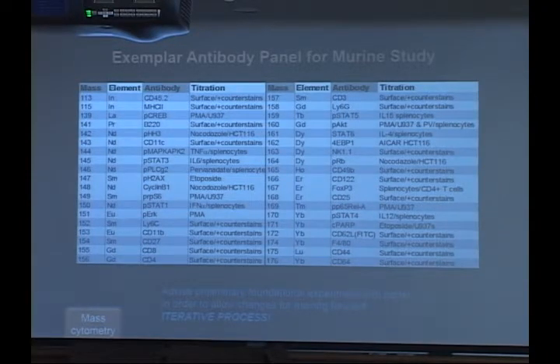Then I think one thing to appreciate is that you've done all this hard work to get your panel into place. Then you run your first foundational experiment. And I cannot emphasize enough doing a small foundational experiment. Don't go in and do 50 samples. Just do 6, a few, because then you'll find that some antibodies are not particularly helpful and you wished you'd put in something else.